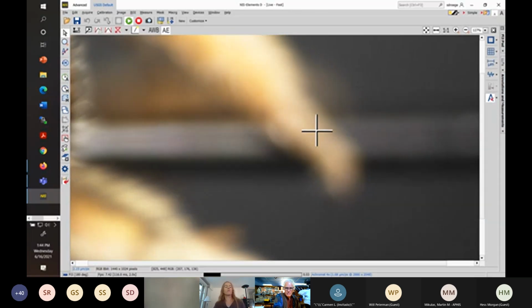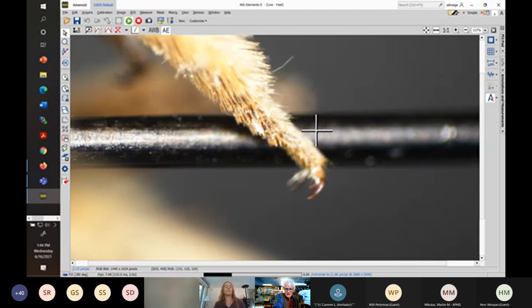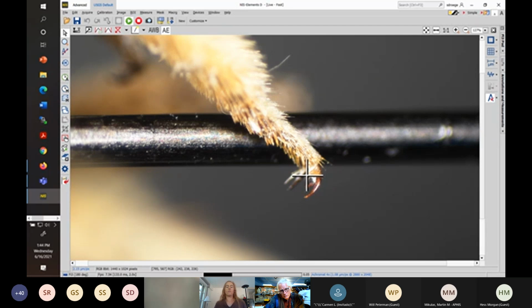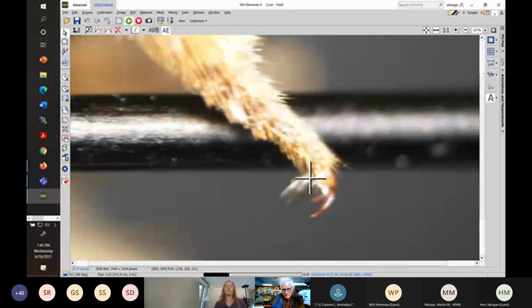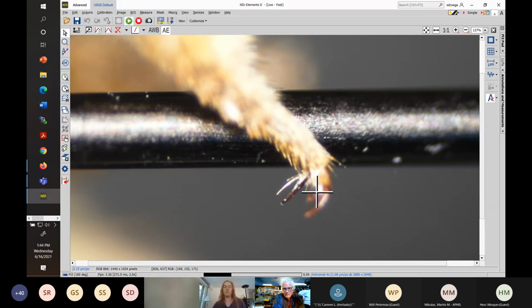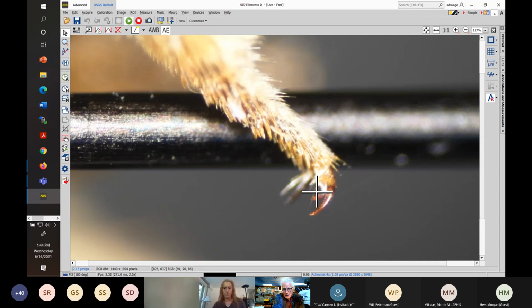And if we zoom in again, on the tarsal claw there's a tooth, and in between, in this in-between area, there is no pad. There are hairs, which if small you might sometimes mistake for a physical structure with integument and as pad-like.